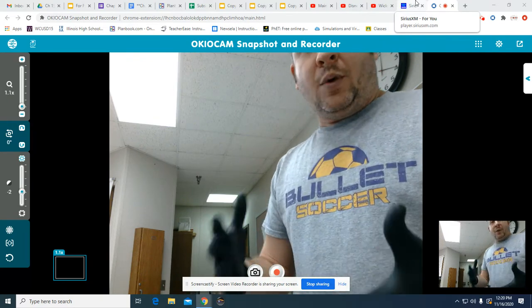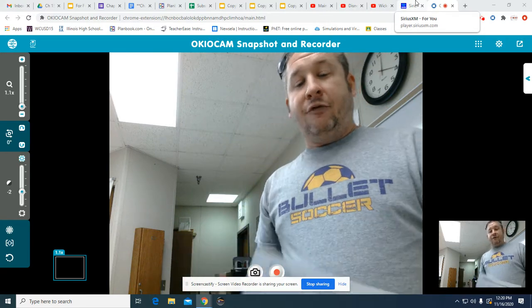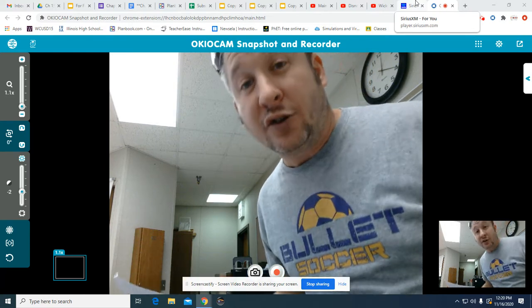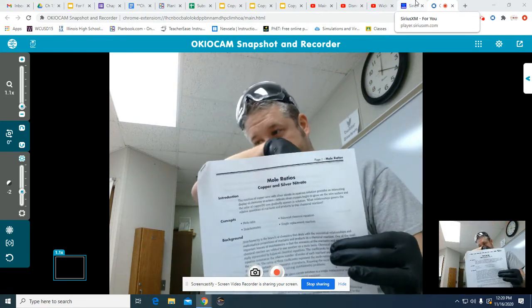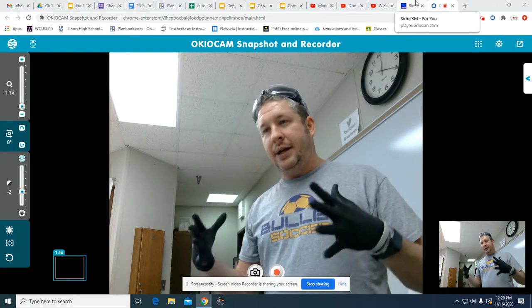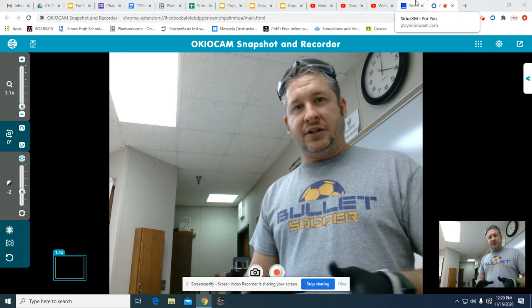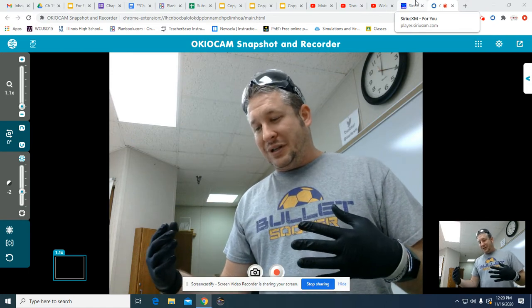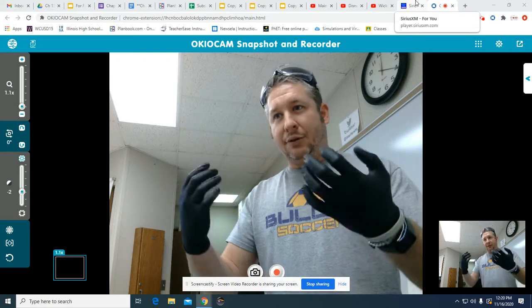Anyway, we are here to work through our lab that unfortunately we cannot do this year because of extenuating circumstances, if you will. We're going to be doing the mole ratios, the copper and silver nitrate lab. And this is actually a really awesome lab. It ties in pretty much the entire chapter pretty well. And it also is neat to see how this reaction actually takes place, what happens throughout the process.